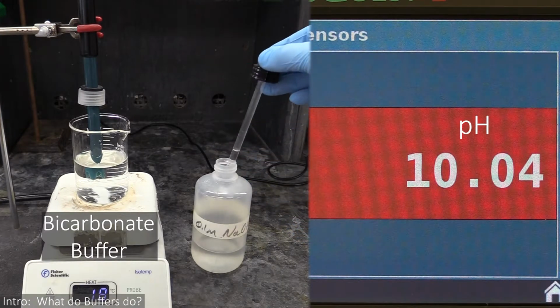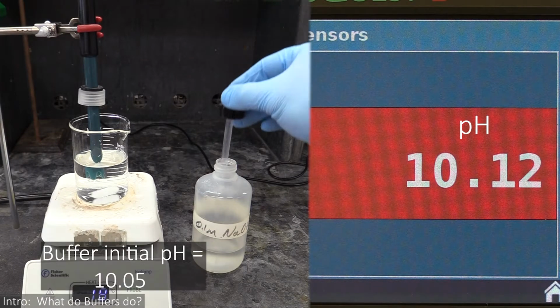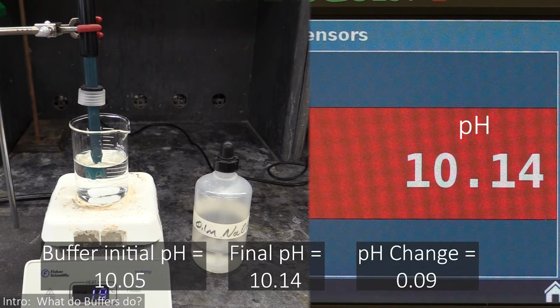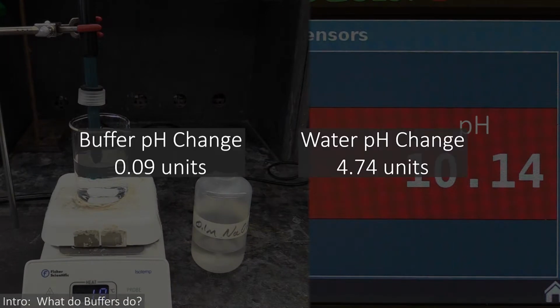Now let's see what happens when we do the same thing to the bicarbonate buffer we made. The buffer starts out at pH 10.05 and rises to pH 10.14 after we add the base, for a pH change of 0.09 units. So for the same amount of base added, the buffered solution underwent a smaller pH change than the DI water.